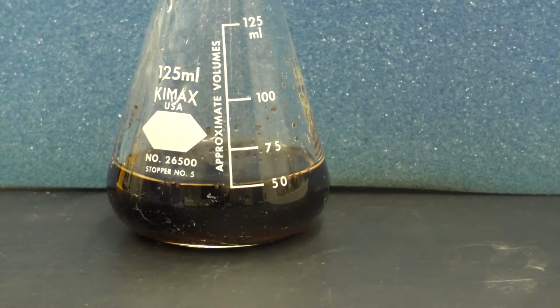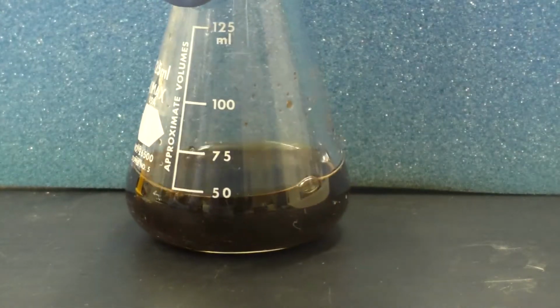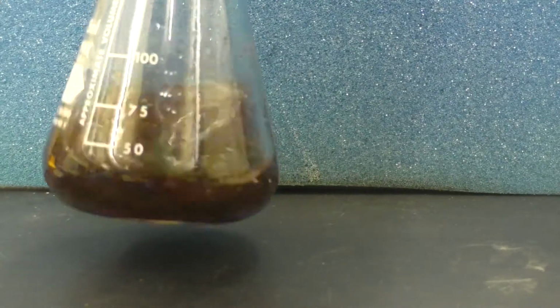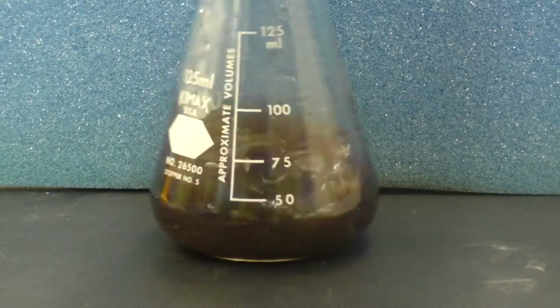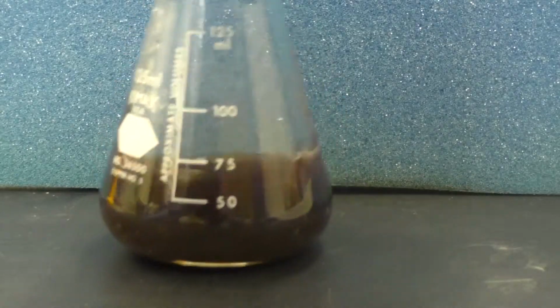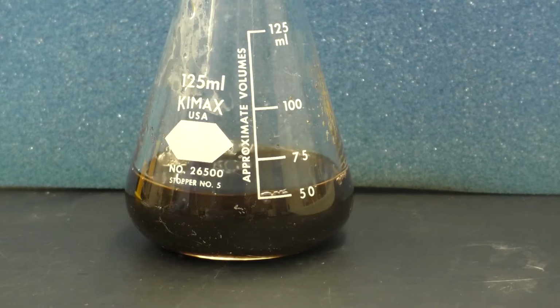The solution is going to be very dark. We'll go ahead and swirl this now. Try to see as much as possible what we can get dissolved. We'll swirl this for a while to make sure we get as much as humanly possible dissolved before adding the 500 milligrams of activated charcoal.